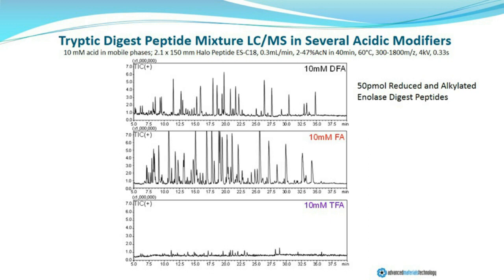And when we have looked at now over 400 peptides, we see that difluoroacetic acid is about the same performance overall as we get with a mixture of formic acid and ammonium formate, a little bit less variable, a little bit more suppressed than we get with the ammonium formate formic acid mixture, but that formic acid generically shows an impaired chromatographic performance.